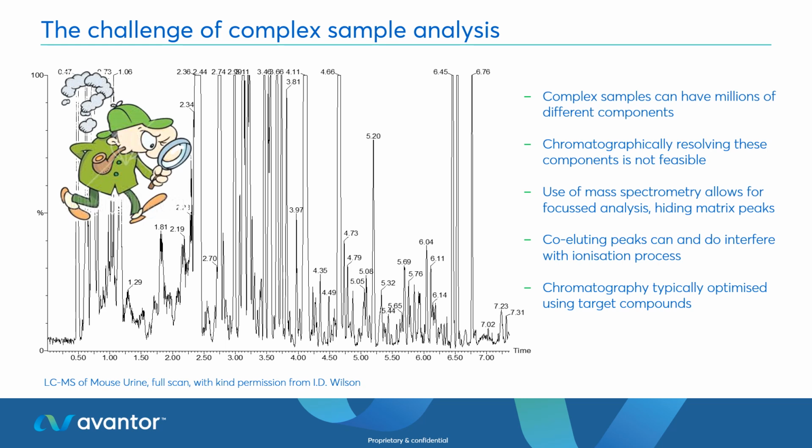And so if we look at trying to use complex samples when analyzing with LC-MS, we will have complications. What we also tend to find is that the chromatography in a bioanalytical environment tends to be focused on an individual analyte, and so we don't actually monitor the chromatography of non-targeted compounds. And again, this can be very detrimental to the overall analysis.